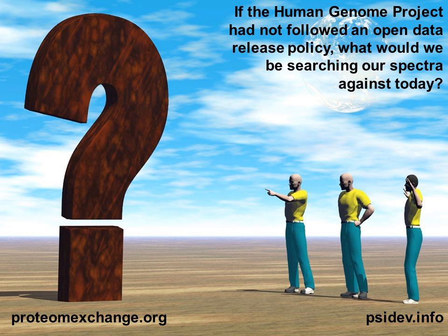So the idea is you can first zoom in on the relevant data sets, and then you could actually query specific data sets at the level of protein and peptide identifications and quantitations, but that is still very early work. At the moment, the answer is no, but we are planning this at a different level, not directly as part of ProteomeXchange or the data discovery index, but as a next step.